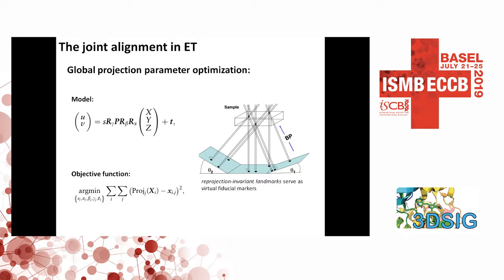And then in global, we can get the difference of different patches, and the different patch centers could reflect the pitch angle or something else. So we can make an iterative optimization between global and local optimization to fix these problems.